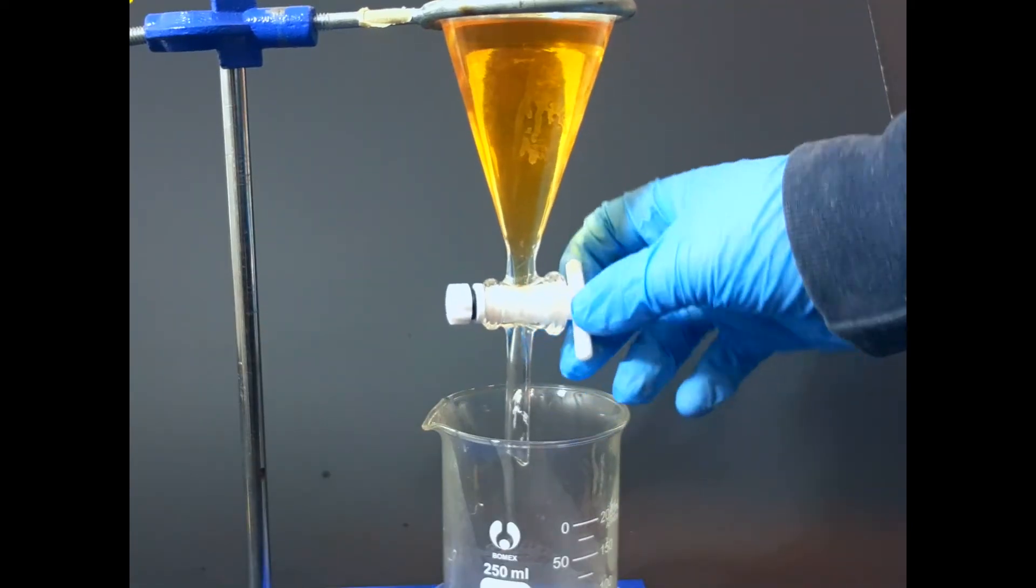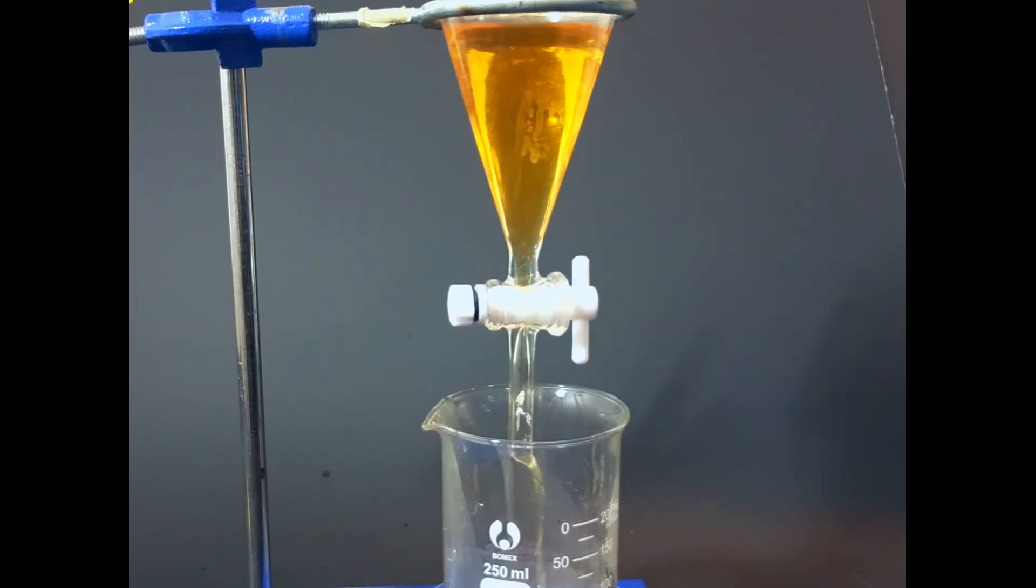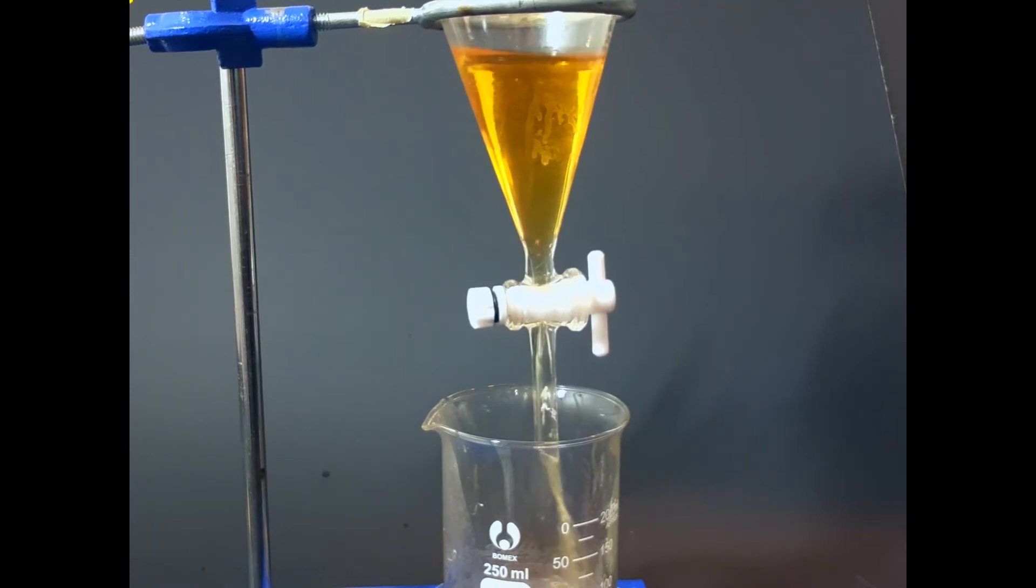As you can see, my solution is still colored and it normally would be a very light yellow. But again, because I'm using soluble coffee, some of the theobromine is not going to be dissolved. Now I pour everything into a beaker down below.